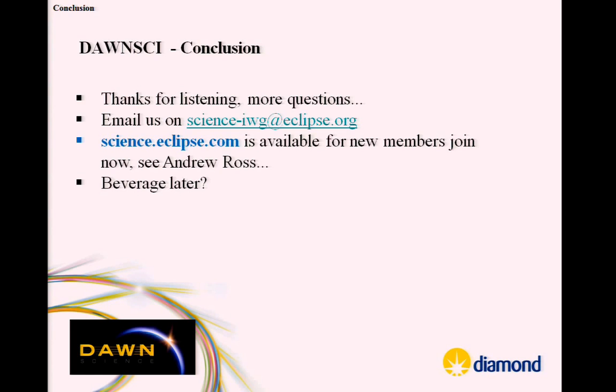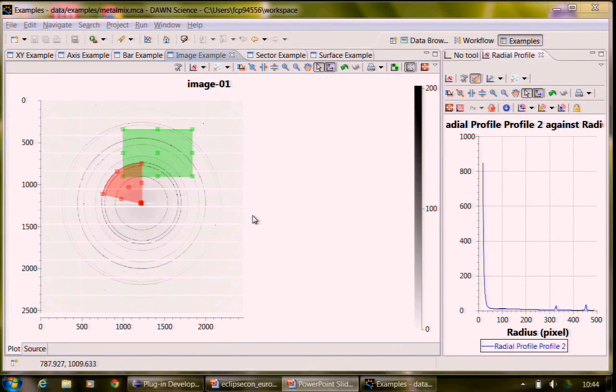I think also the learning curve is quite low. Yeah, I saw this example. It's just a few lines. You should definitely do that. Have a play with it. We're open to suggestions. It's still a work in progress. You can do so much, but for us, we just have a simple case. But if we can show this and have these nice selections and then show peaks and stuff, it's really great.